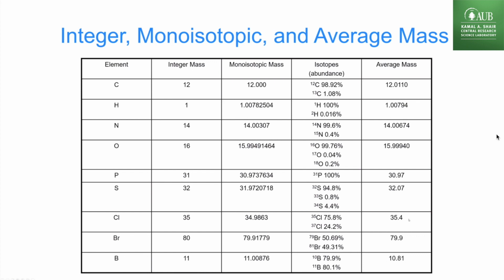So this is a handy chart that you can use for interpretation of your molecules. And of course, this is in the memory of the computer, so the computer knows this information. When it's doing the data analysis in an automated way, it builds the mass and the isotope pattern from this chart. So if you put in a complex formula of C12, H6, O3, and S, it builds that molecule from this data, and it comes up with the monoisotopic mass and the isotope abundance for that compound.